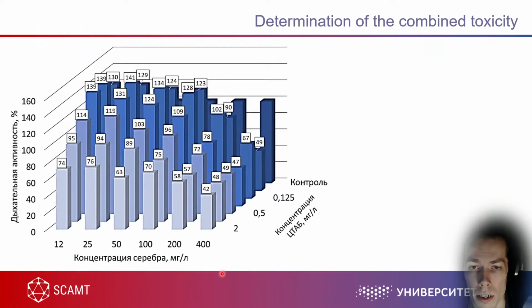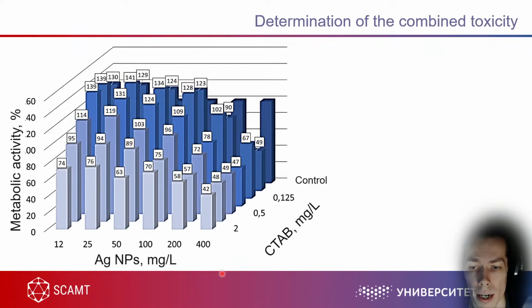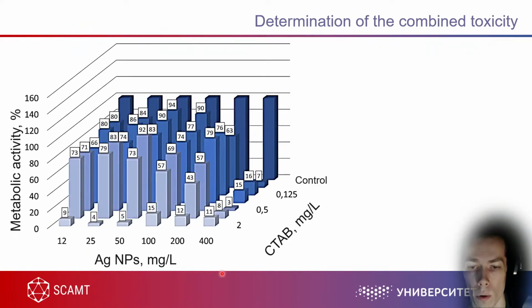And this was on the first day, on the second day, and finally the capabilities ended. So there is, let's say, some storage of these molecules, some ability of the cells to withstand, but these abilities are limited. And on the third day, these abilities just ended and the cells died. This can be easily revealed if you stain your cells for glutathione concentration, and you will observe a decrease on the third day.